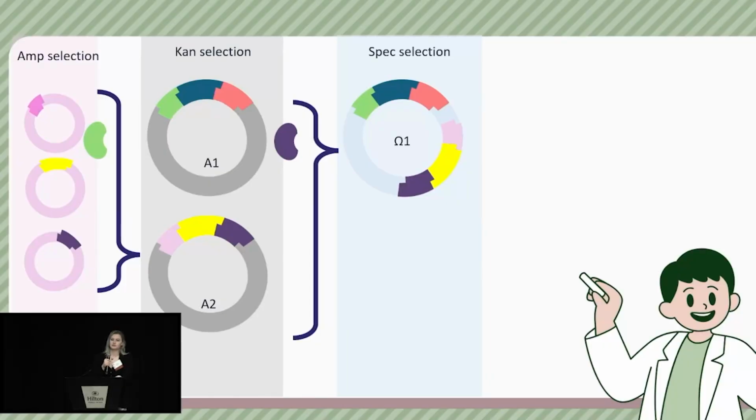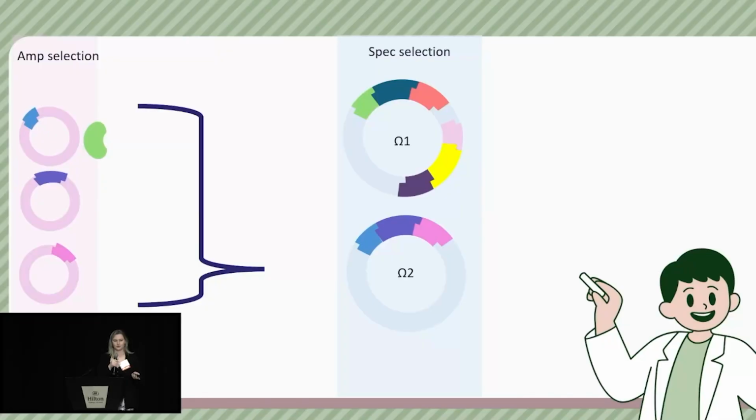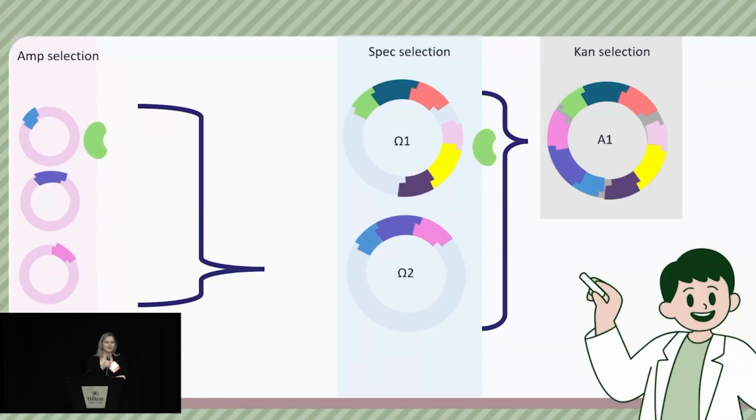Now, the reason they don't use level 1 and 2 terminology is because they can also allow for you to use these level 0s to clone into an omega. So it's not really a level 2. They both allow for you to clone into either of these starting points, alpha or omega. And then it does allow for cycling because you can use that BSA1 again to cycle back into an alpha acceptor. These presentations are about to get very colorful. I'm sorry, I kind of run out of colors at some point when I'm making like 10 plus assemblies.